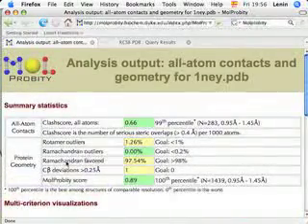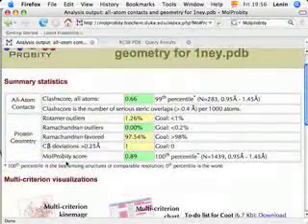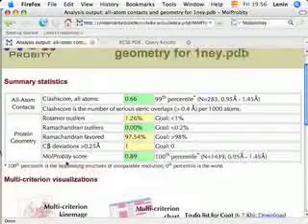So far, this is one of the best structures — it is almost perfect. The percentiles are the highest. If you are planning to do some computational procedure using a TPI structure, a particular GIS-TPI structure, I would certainly pick this one based on its quality.